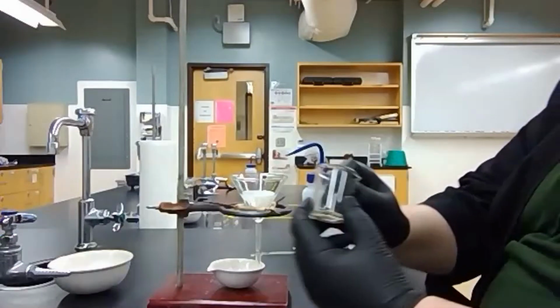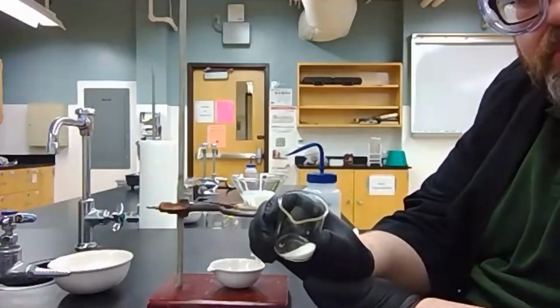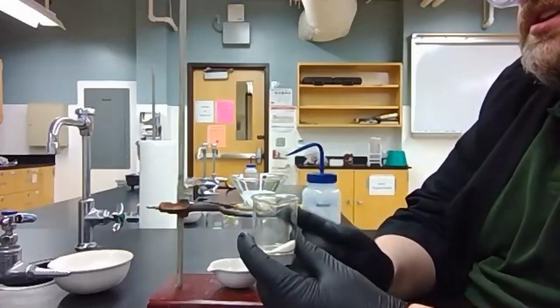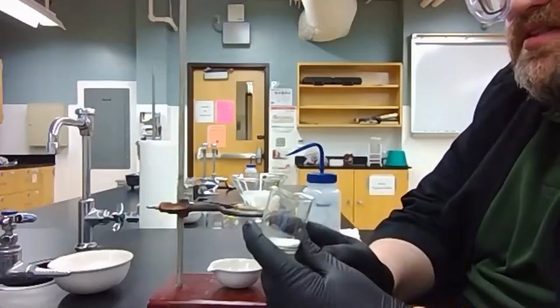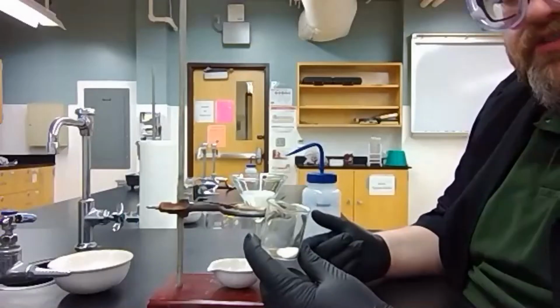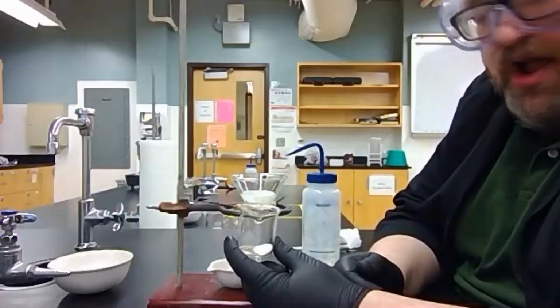Okay? So I've got my mixture of salt and sand here, and remember, the salt is soluble in water. It will dissolve in the water, but the sand will not. So what I need to do is use the least amount of water possible to dissolve all of the salt that's in here. I don't want to have to dry off a whole bunch of extra water later because water is very difficult to dry off.